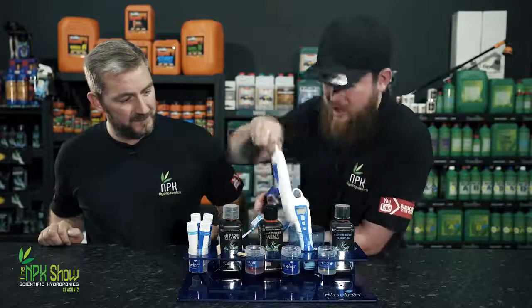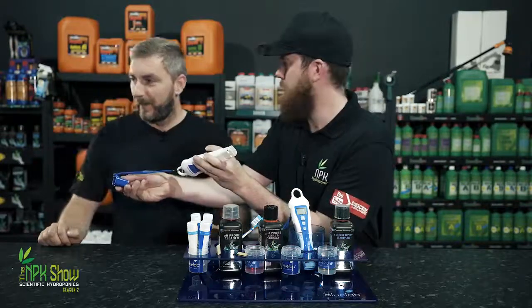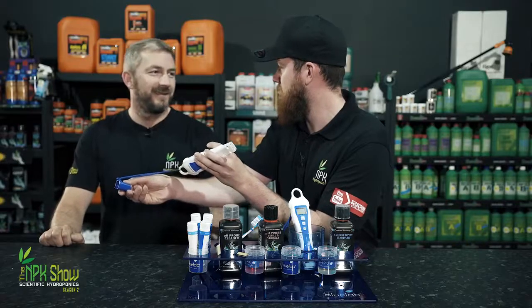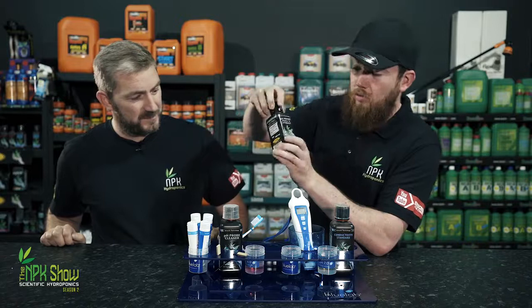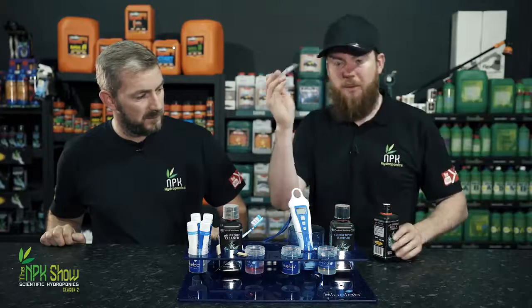So we give it a rinse, flick it off on the floor. On the floor. And what's in the bottom of that? A little sponge. Let's show them. Nice sponge in the bottom of the cap. What's that sponge for, Barry? To keep it moist. Do you like it moist? I love it moist. Good. So does the pH probe. So you have pH probe refill and storage. Be ideal to get a pipette.